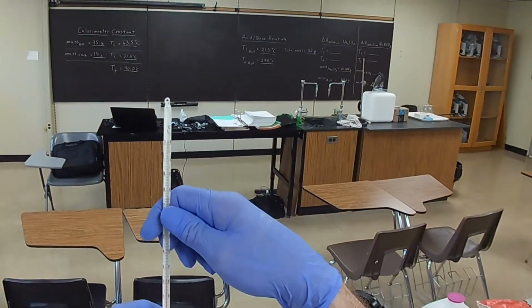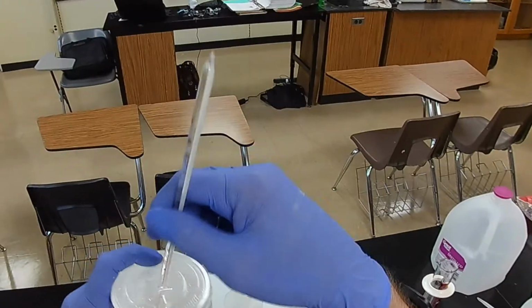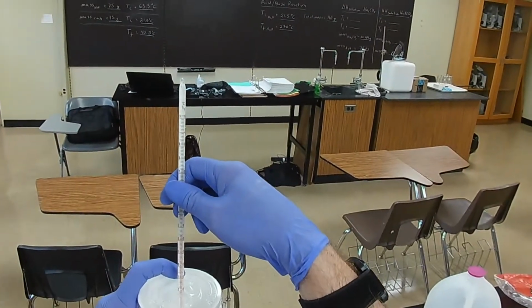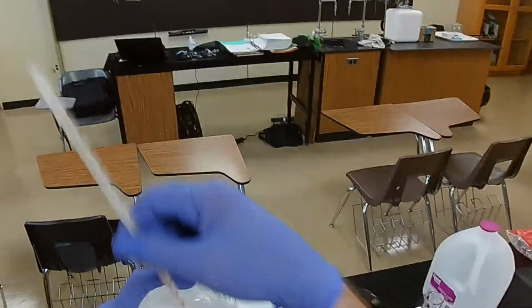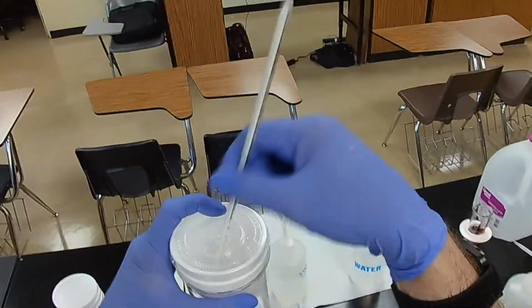See where we're at. We're up to 23. Yeah, we're up to 22. 23.3. We want to get the peak. What's the highest temperature that's reached? 24. There must still be some sodium carbonate in there that hasn't dissolved yet.